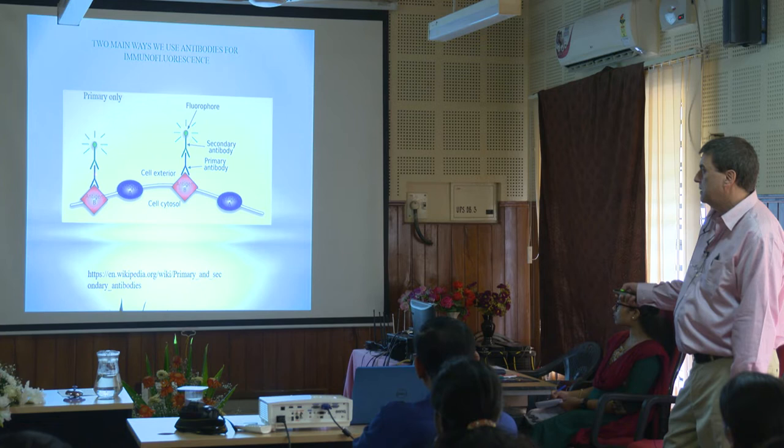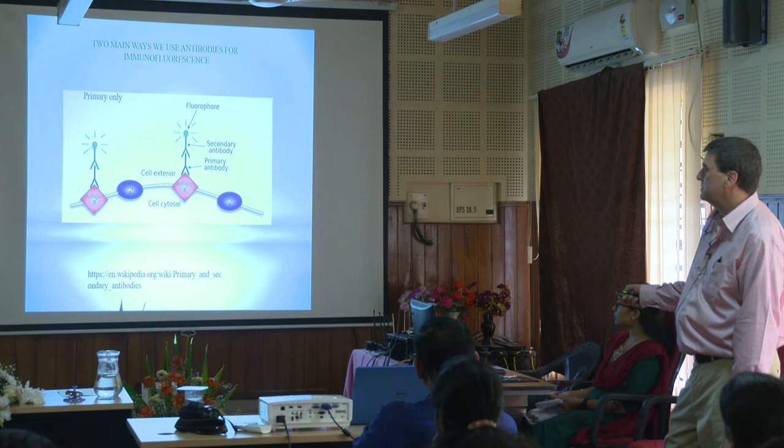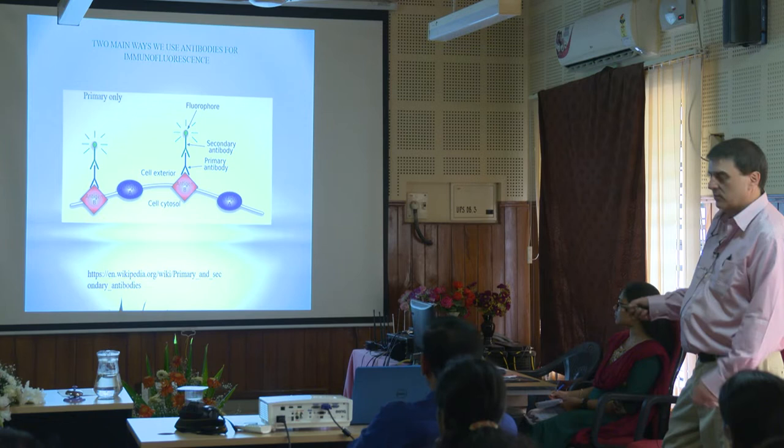I sort of drew that wrong a little bit. Anyway, pretend this thing isn't here. Pretend this is just sticking right down. So we have a fluorescent tag on one antibody. We have taken our primary antibody.